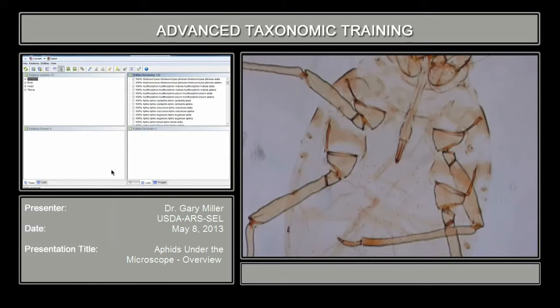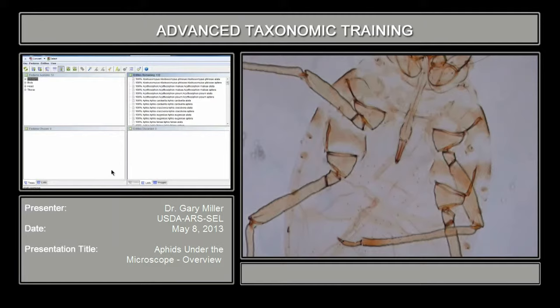Moving down further to the mouthparts, mouthparts structures are this area right in here — aptly named because of the Sternorrhyncha, as it's lower in the ventral area of the specimen. The URS, which is called the ultimate rostral segment, is another structure that's measured. It's the tip of the mouthparts, measured in its length, and often in a key you will have to count the number of chaetae (CD) that occur on that rostral segment.